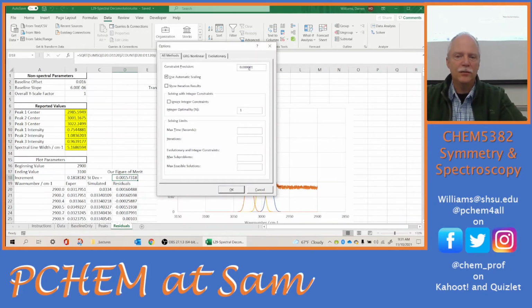Constraint precision, we have it set to 1 times 10 to the minus 6. So that's sort of how tight we optimize to. And again, I don't really fiddle with these, but they're there. Okay. Now let's try to break it.